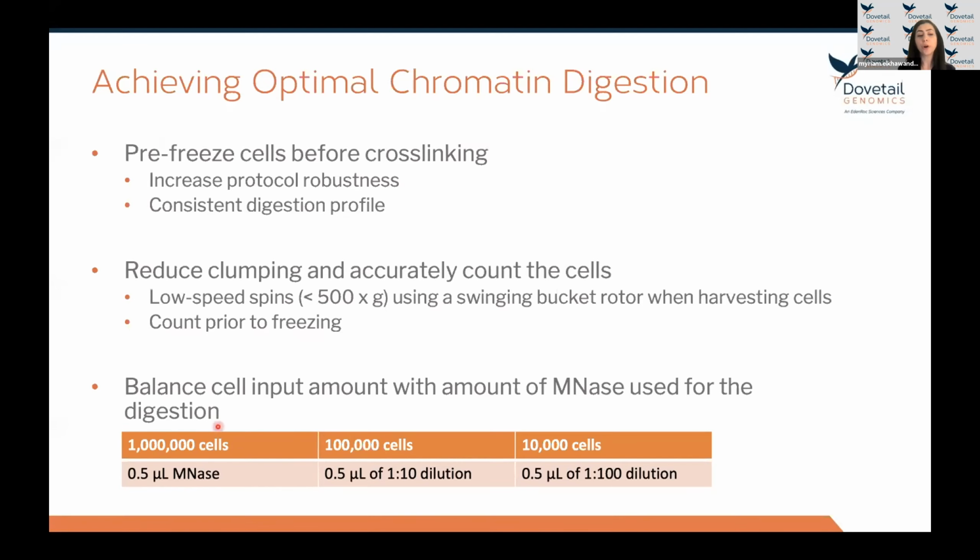The standard protocol calls for 1 million cells, but if this number of cells is not available to you, we also provide digestion guidelines for lower input down to 10,000 cells.